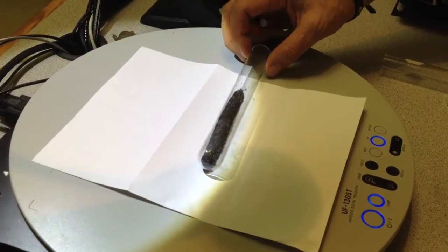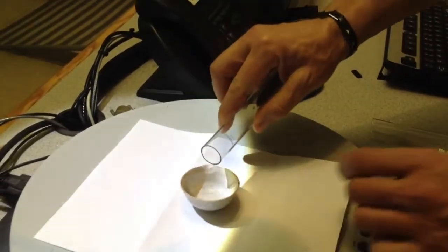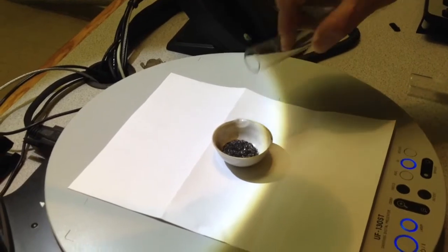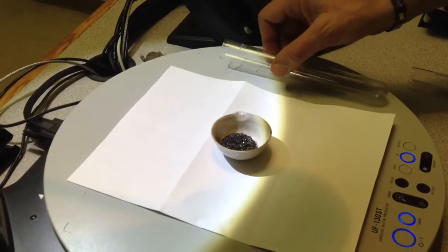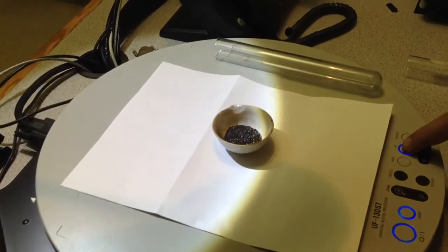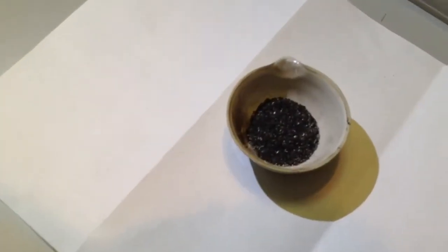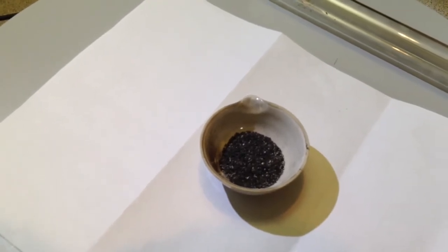This test tube is filled with a material. As I pour it in there, I want you to take a look and recognize the morphology of the material, if you would. You see it? I'm going to zoom in on it. Let me get a picture of the screen. You can take a picture of the screen.